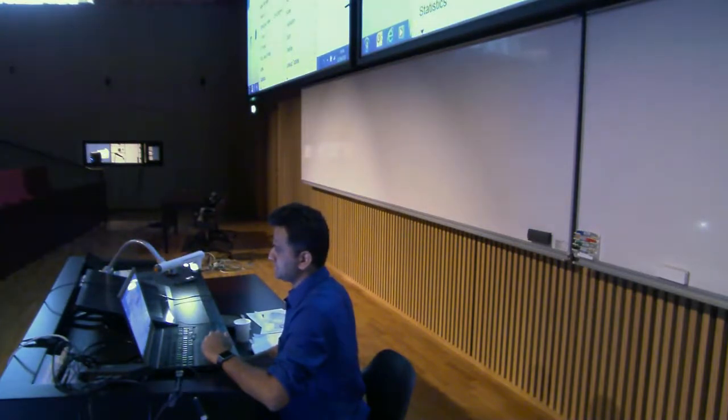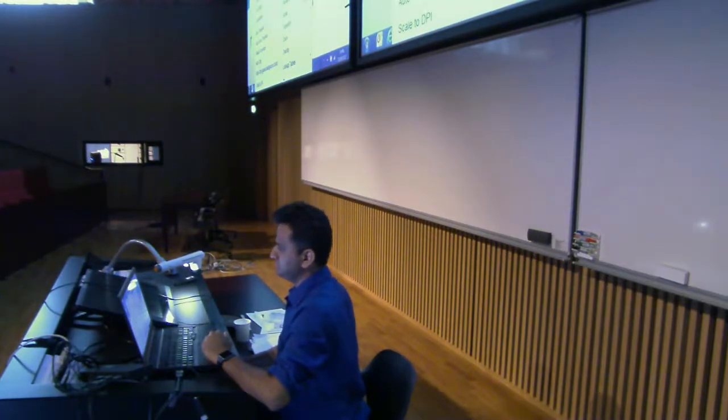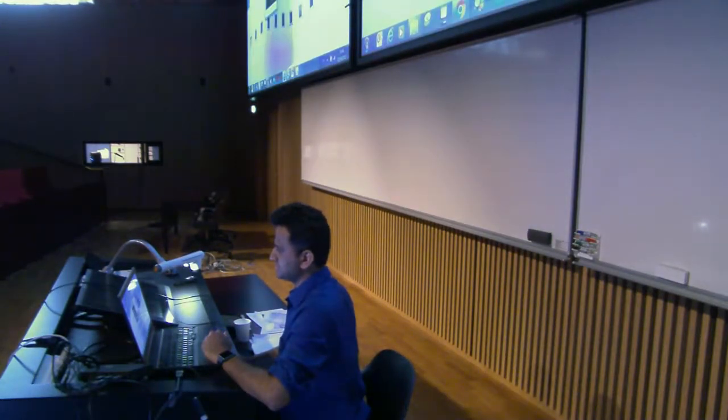What I wanted to tell you is that you can add a slice and you can delete a slice. If you want to delete this particular slice, just go to Stacks and Delete Slice. This slice will be deleted. Now it's gone. There are also next slice, previous slice, Images to Stack, and Image, Make Montage, which we have seen. Very important, this is Project.